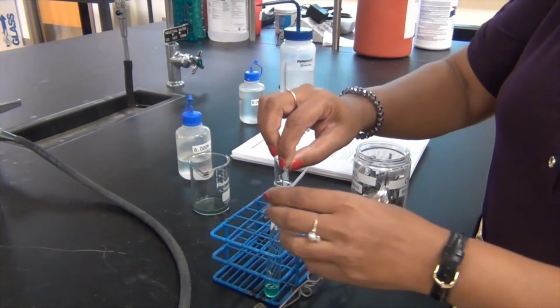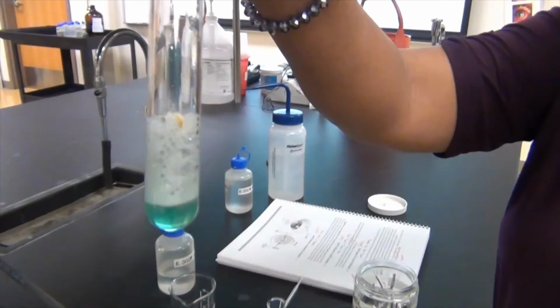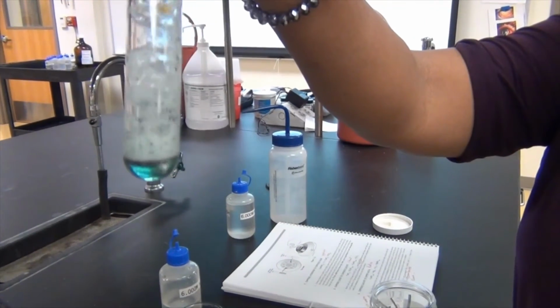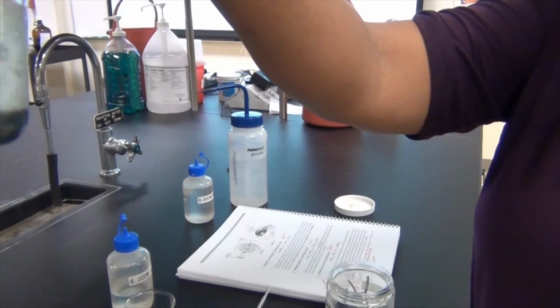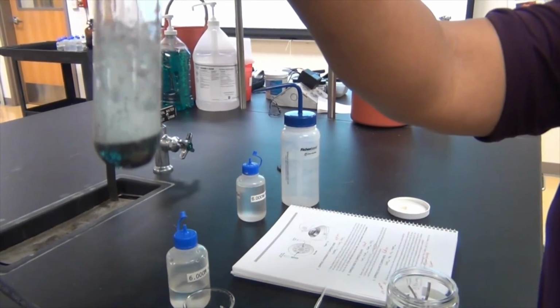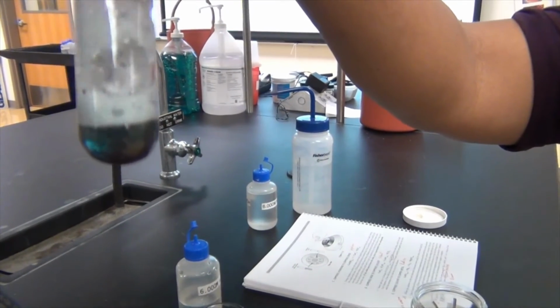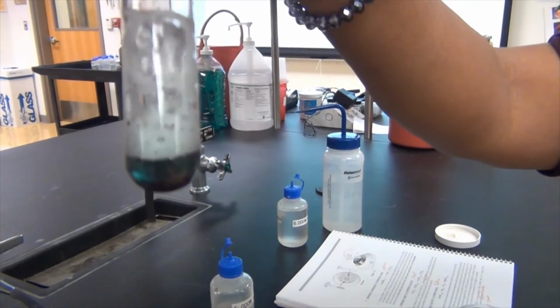So I want you to look at this carefully as to what happens when we add the magnesium. Look at the reaction, what is supposed to happen, and then see what's happening here. Look at any other changes going on in there. For example, any solid formation, any color changes. I know, that's a pretty intense reaction going on, right? And you're probably thinking, oh my God, I missed all of that. I'm so sorry. Okay, I'm going to shake this now. Don't get dizzy.